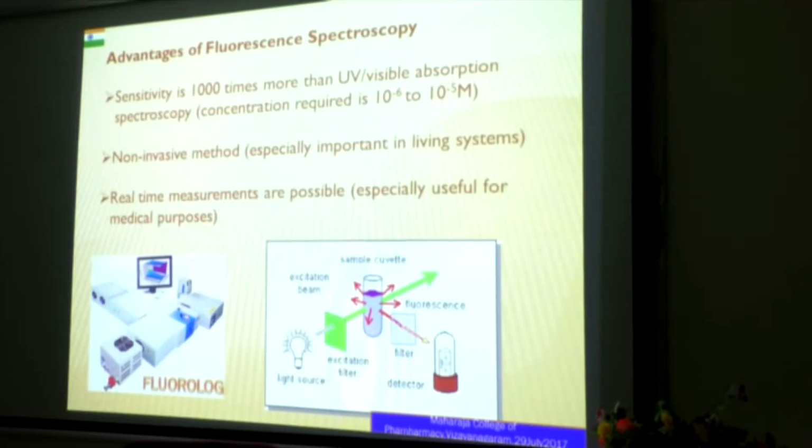And this blue color box is where you keep your sample cell, like a UV cell, the same cell as in a UV-visible spectrophotometer, and then you observe the luminescence. If you are passing light to your sample in this direction, we observe the luminescence at 90 degrees to this. The light coming from the 90 degree angle of your cell goes into a detector, invariably a photomultiplier tube, which catches photons, amplifies them and gives you the signal. Nowadays we have computers and software, and it is very simple.